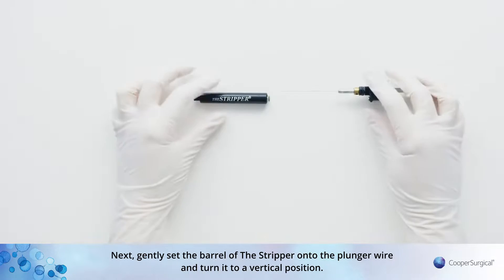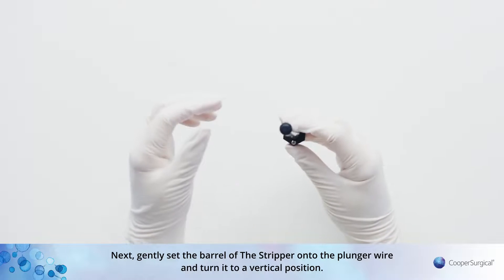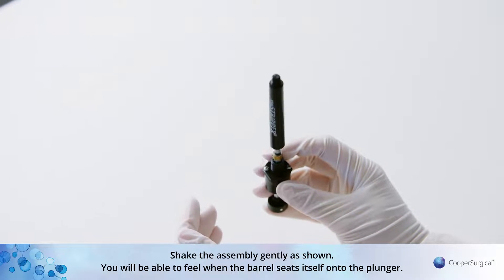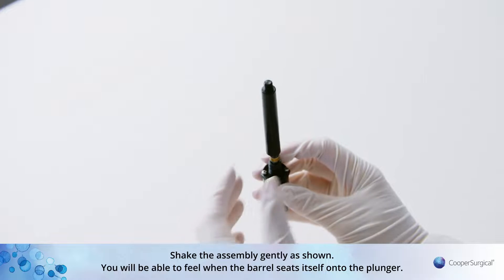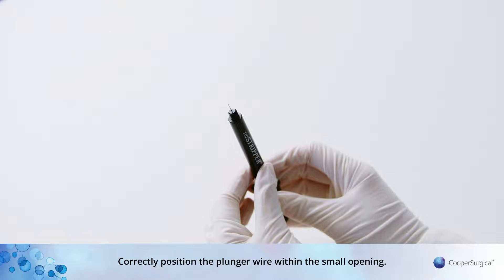Next, gently set the barrel of the stripper onto the plunger wire and turn it to a vertical position. Shake the assembly gently as shown. You will be able to feel when the barrel seats itself onto the plunger. Correctly position the plunger wire within the small opening.